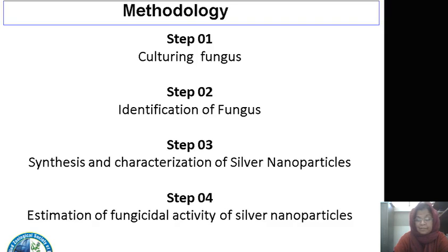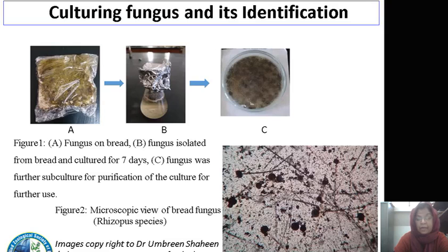This is a simple methodology of our research design: we cultured the fungus, we identified the fungus, then we synthesized and characterized our silver nanoparticles, and then we estimated the fungicidal activity of our silver nanoparticles.